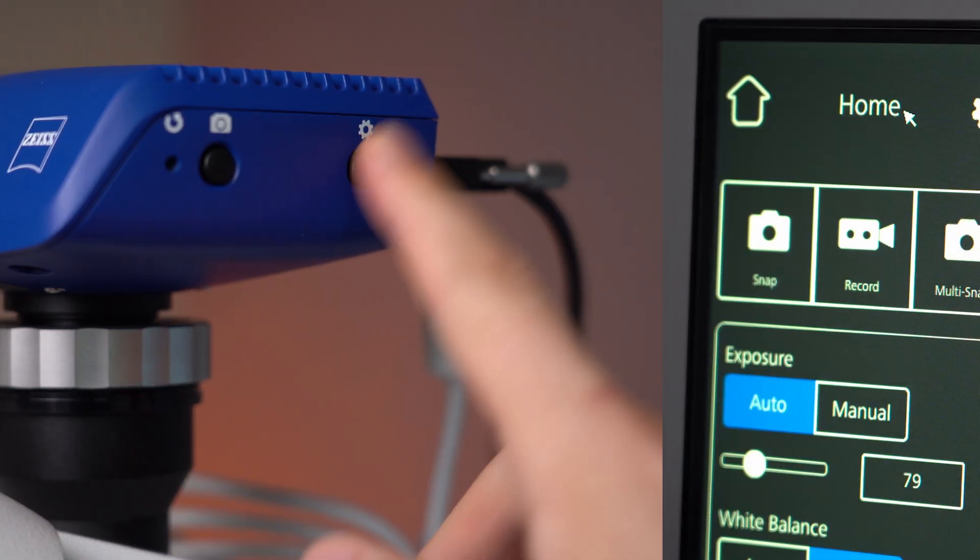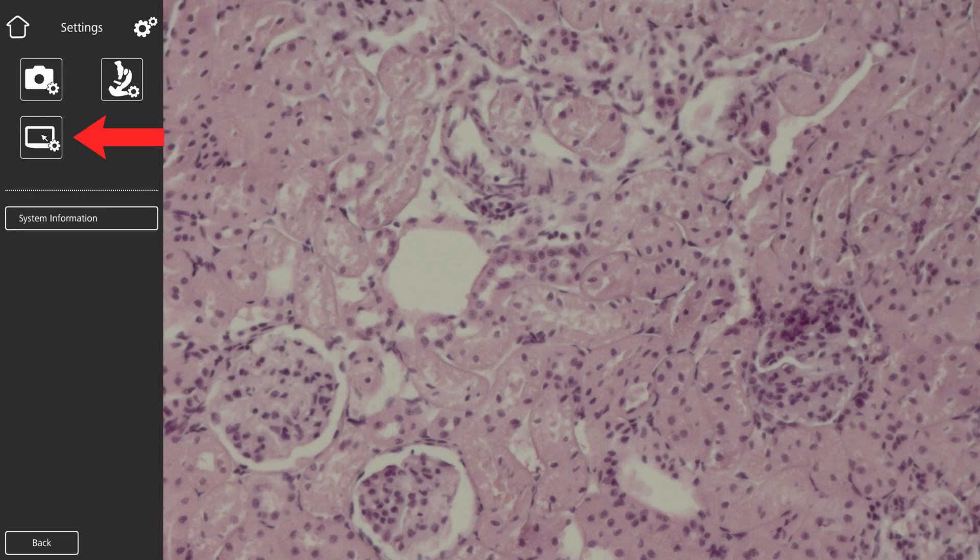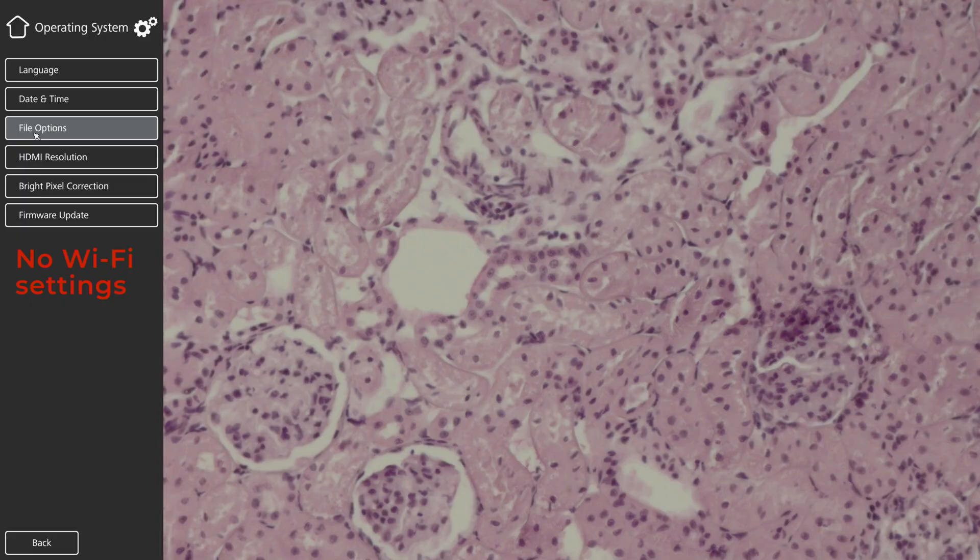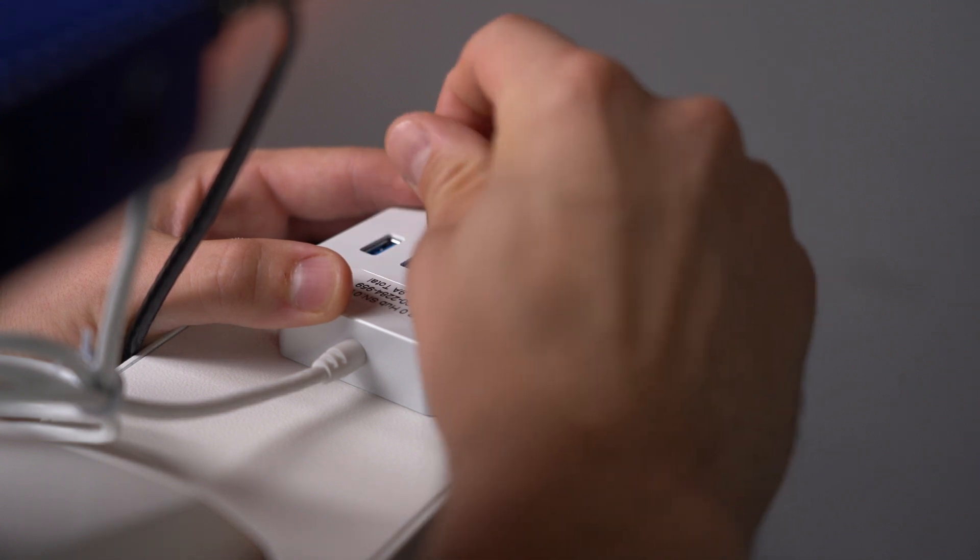After the image appears on the screen, press the settings button to open the OSD menu. Go to settings, operating settings, Wi-Fi settings. If you can't find the Wi-Fi settings button in this list, check the connection between the Wi-Fi adapter and the Axiocam camera or change the adapter to a compatible one.